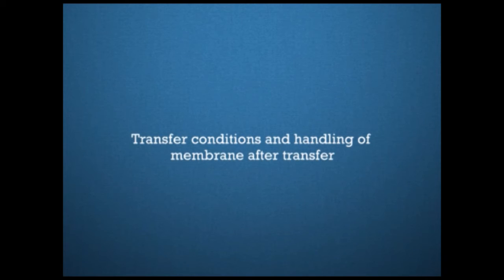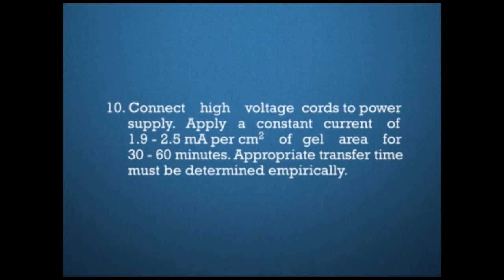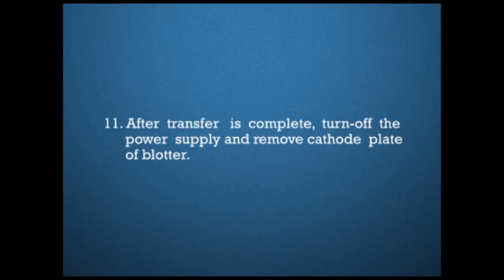Transfer conditions and handling of membrane after transfer. Connect high voltage cords to the power supply. Apply a constant current of around 1.9 to 2.5 milliamperes per square centimeter of gel area for around 30 to 60 minutes. Appropriate transfer time must be determined empirically.